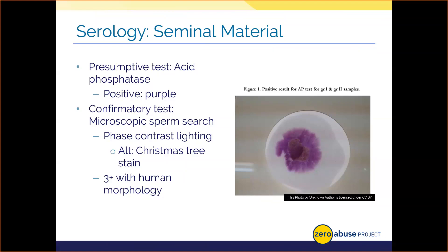AP testing results aren't always this simple. Sometimes weak positives — a pink coloration — have been known to occur. Some analysts will call this a slight color change versus a true positive result, and some labs handle these differently. Personally, I would test with a confirmatory test since we can't rule out the presence of semen, but some labs have strict policies where they only process samples with purple coloration, meaning any slight color change may not move forward.